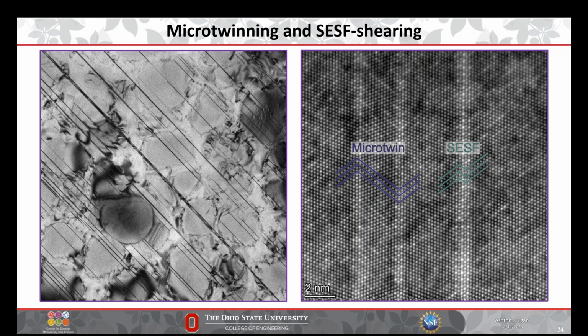Okay. Which SEM model did you apply the ECCI analysis with? Yeah, so this is the Apreo-based system. Dan Vecchi probably knows all of the more niche details about the specific setup of these. But essentially, it's just the Apreo-based system with the Trinity column, and I use an electrostatic lens basically to improve my resolution for this. Dan, any other?